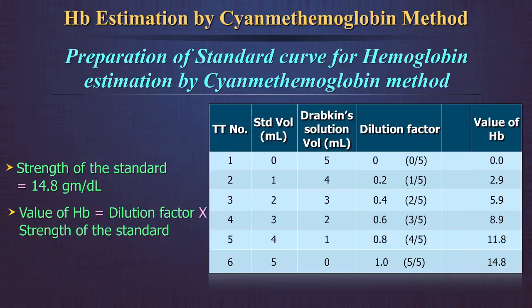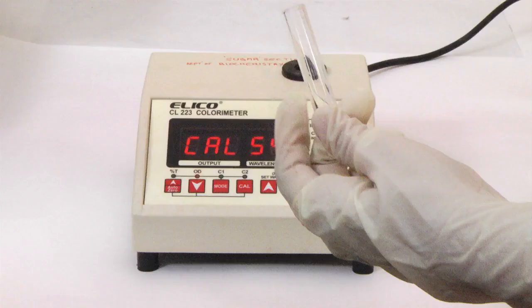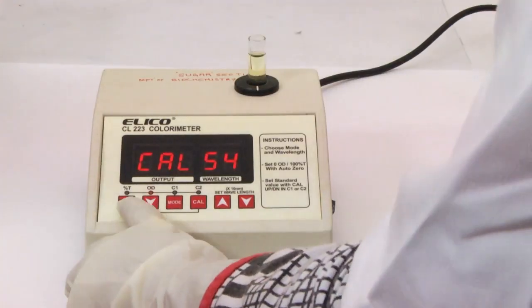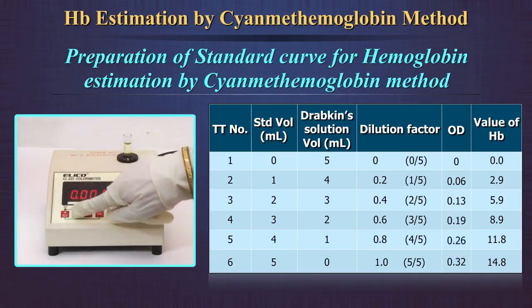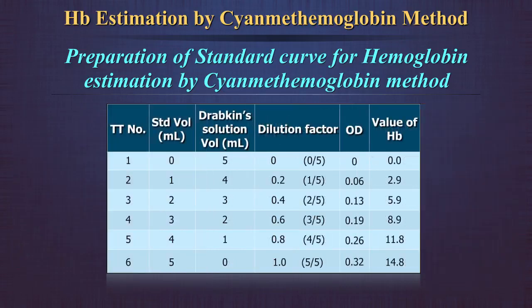Take the test tube with neat Drabkin's solution and transfer the solution to the cuvette. Place the cuvette in the spectrophotometer and set the OD to 0 at a wavelength of 540 nm. Now measure the OD of each dilution in the spectrophotometer against the blank of Drabkin's solution, taking a clean cuvette for each dilution. Record the OD values in a table showing: volume of standard in each dilution, volume of Drabkin's solution, dilution factor, OD values, and value of hemoglobin in each dilution of standard.